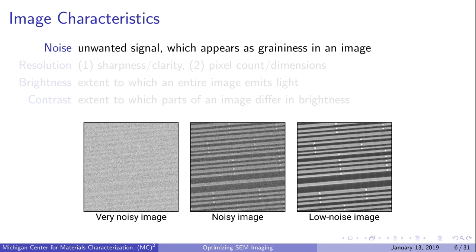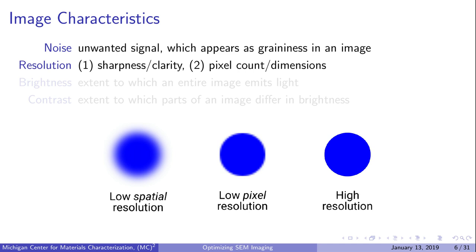Now let's go over some general terminology used to describe images. Noise is any unwanted signal—a signal that doesn't represent what's being imaged, like SE3s. When there is a lot of noise, images appear very grainy or speckled. Resolution has two distinct meanings. The first, sharpness or clarity, refers to spatial resolution, which is how much detail an image contains. The spatial resolution of SEM is around one or more nanometers, depending on the machine. If the spatial resolution is five nanometers, features as small as five nanometers can be distinguished. Images with low spatial resolution appear blurry at normal viewing conditions, even when in focus.